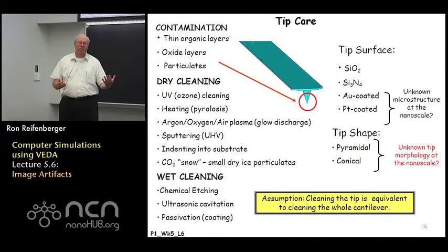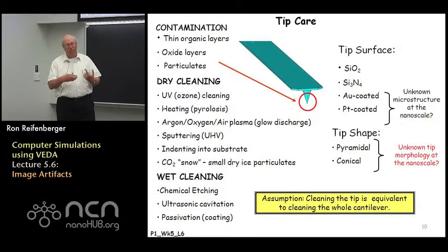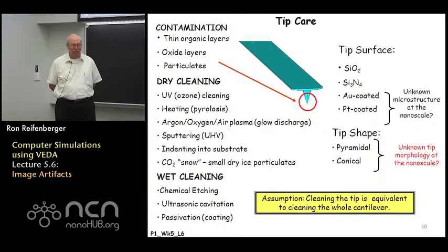So there are different techniques that have been tried to clean tips. These techniques are generally divided into a dry cleaning technique and a wet cleaning technique. Clearly, the wet cleaning technique uses a solvent, a chemical etching process. The dry cleaning techniques tend to remove the contamination of the tip by using energetic particle radiation, so you can use ozone cleaning techniques, argon sputtering, sometimes just indenting the tip into a soft substrate will effectively remove particulates that have accumulated on the tip surface.